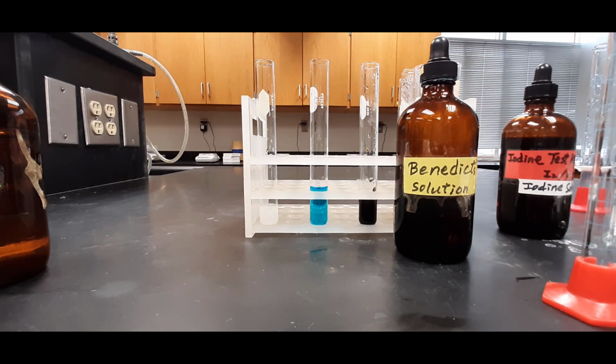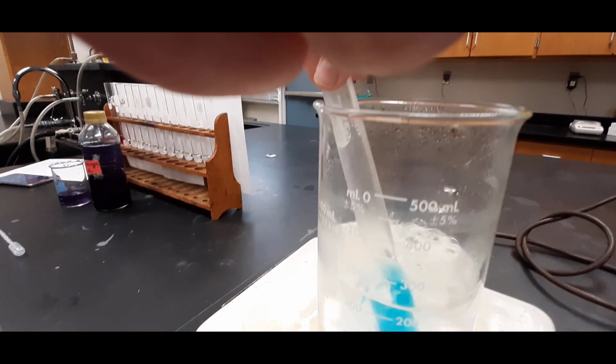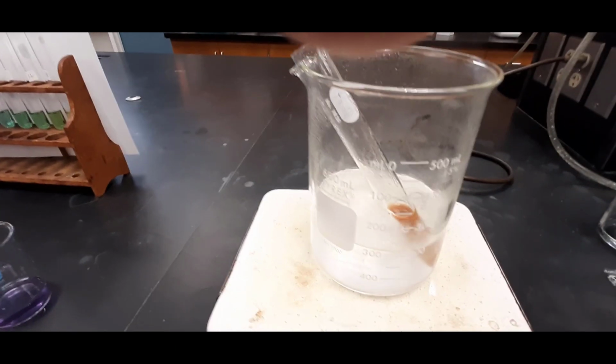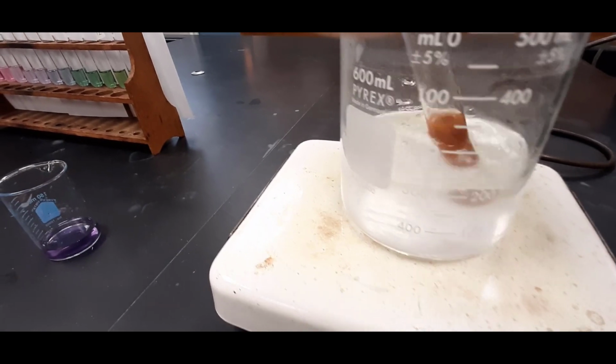I take the test tube to the hot water bath for it to be warmed up for 5 minutes. Five minutes later, we see that a change has clearly occurred.